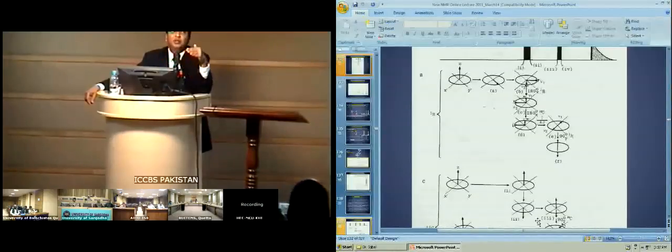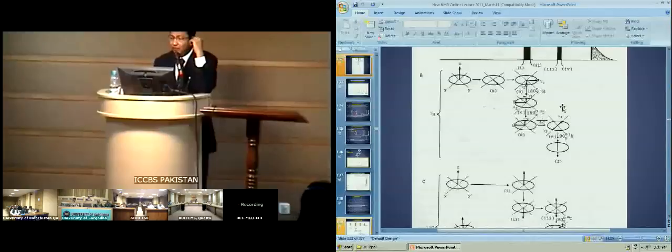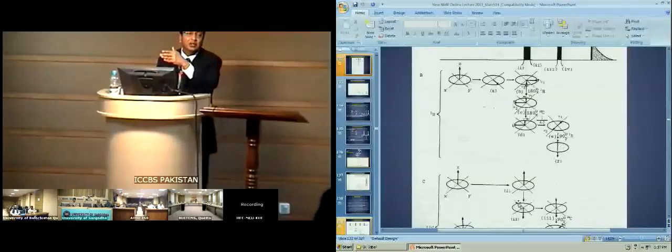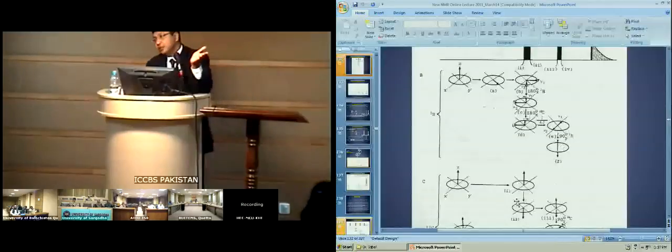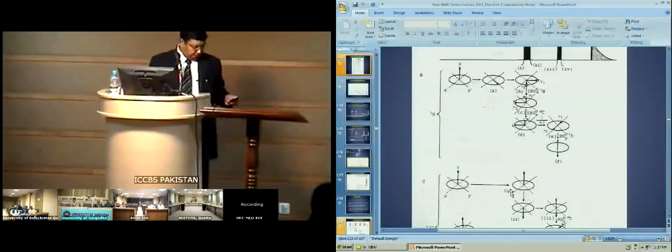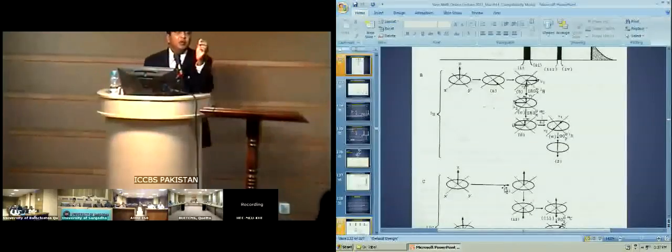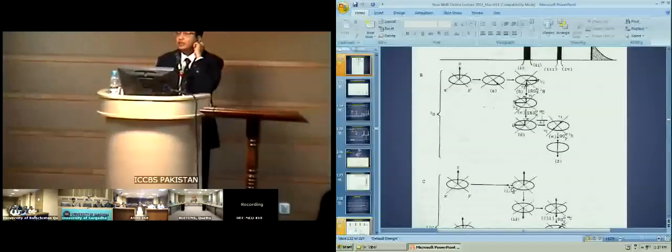And if you are doing it across the board, with a full band of proton chemical shifts and a full band of carbon, and you're creating a situation in which a part of this is now transferred to this, then it is a non-selective enhancement of insensitive nuclei by polarization transfer, right? It is a technique which was extremely powerful, very, very powerful, and has been used to the maximum limit. Okay?